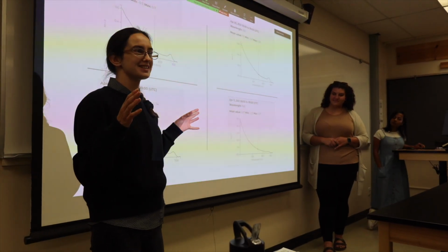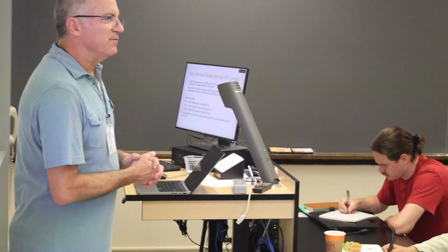This week, I was working with a couple of the other participants to look at ratios between the absorbance in different bands and getting familiar with what we can interpret from that in terms of chlorophyll concentrations and also colored dissolved organic matter.